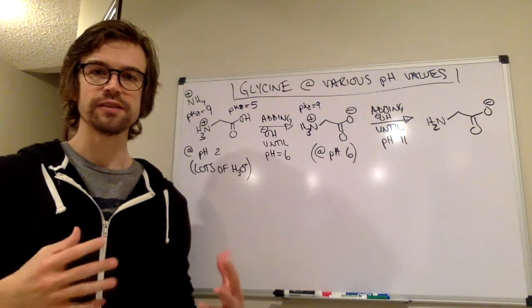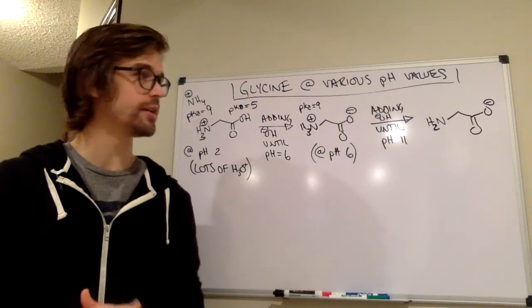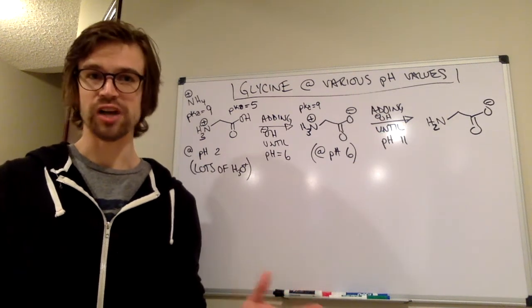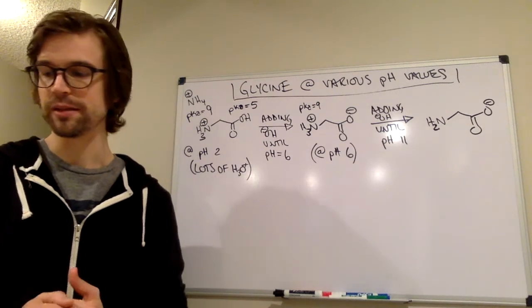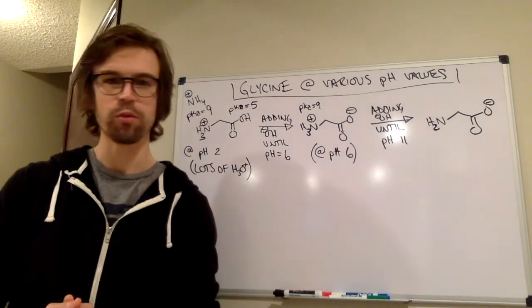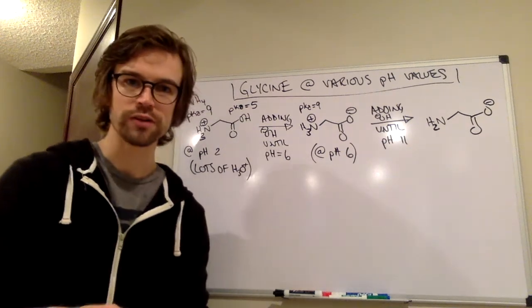So the differences of charge are going to be very important in this acid-base extraction stuff, and that's how we're going to be able to isolate molecules based on this extraction technique, based on their solubility. So more on that after we do our introductory experiments. We're going to work through the tables, essentially the extraction concepts, which is the first part of the report sheet that you will be doing, and then we'll have another little meeting like this. So we'll talk soon.